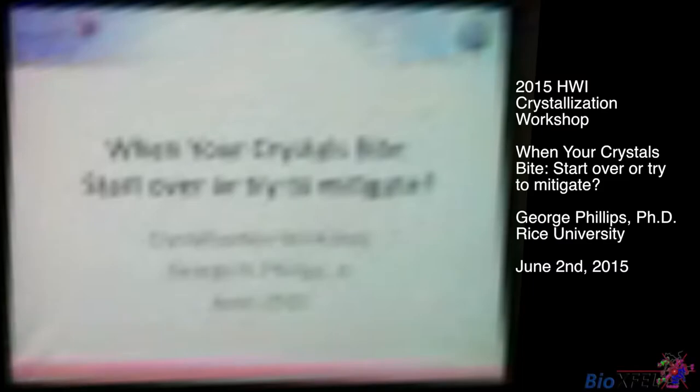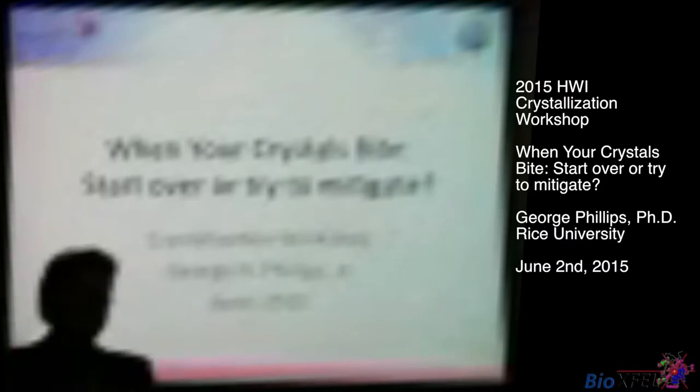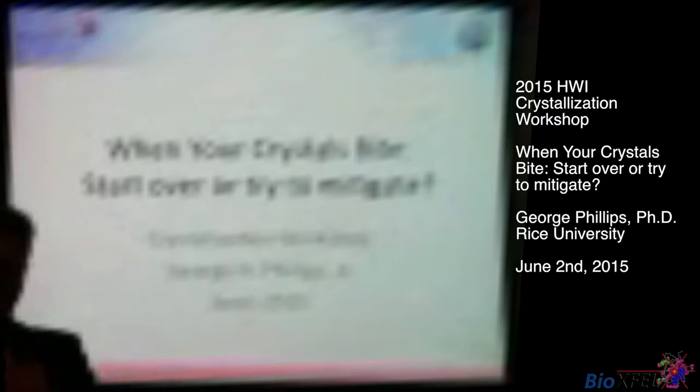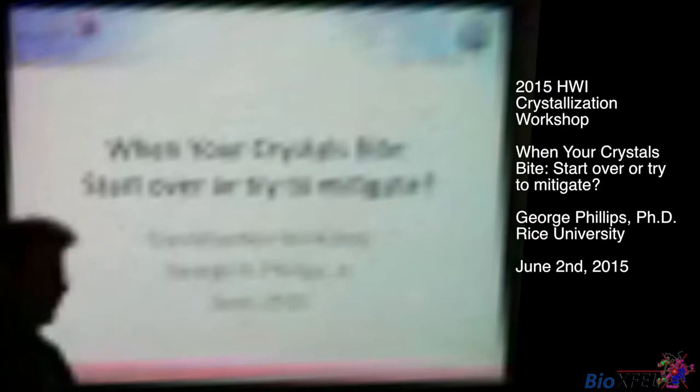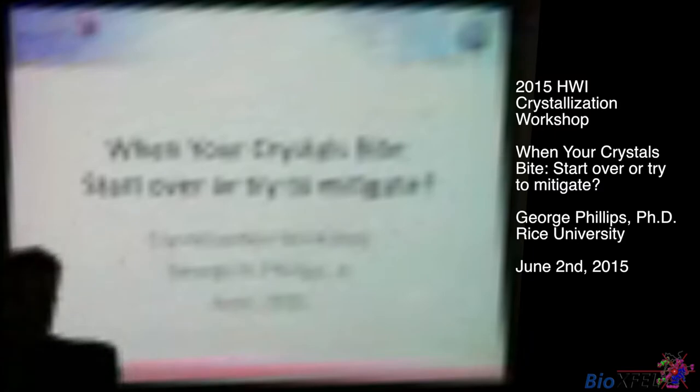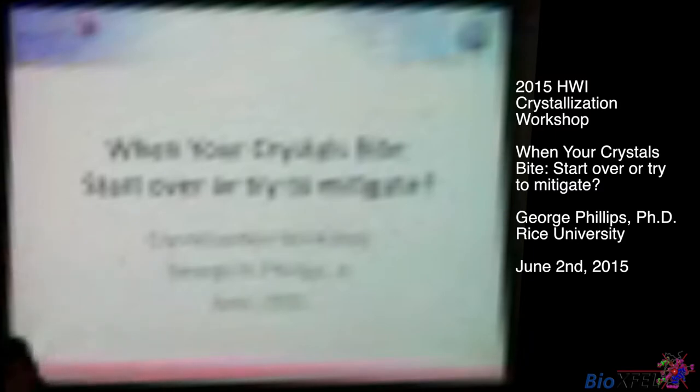I'm supposed to talk about when your crystals bite. I'm usually less polite than that. I would have used a different word, but what I'm going to try to do is talk about some of the pathologies that occur with crystals. Many of these are deal killers. Some of them are not. It's hard to know when to give up and start over.